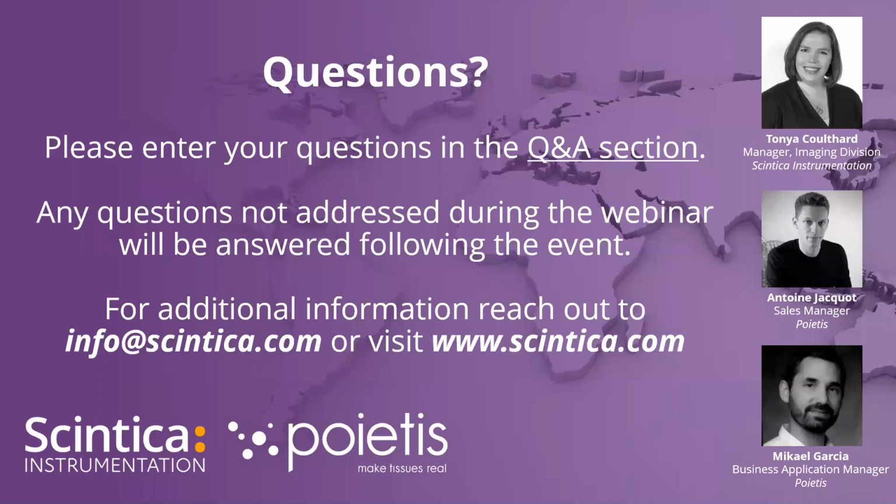The cell media is very simple and easy to prepare. It's the normal media that the cells will be contained in. And as Antoine showed on an earlier slide, the cells are simply pipetted onto that metallized substrate slide. So this is a small circular slide. The media is pipetted on and basically spread gently over the surface of that metallized substrate, and then that's put onto the laser-assisted bioprinting head.